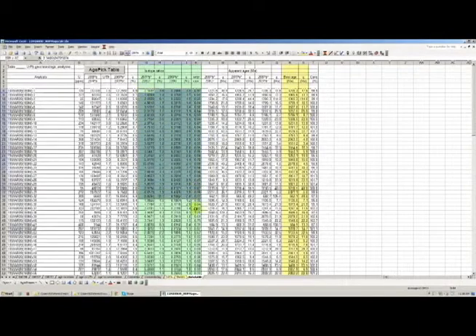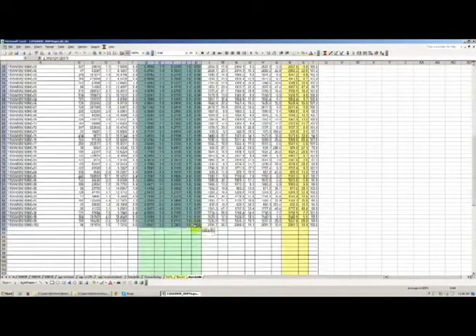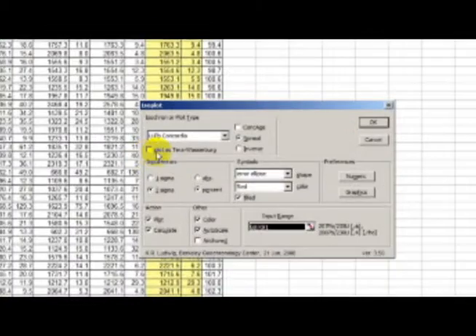So you want to take the columns that you want to plot, just highlight them all. Right. So you go here to the upper ribbon and click on the Isoplot icon again. It opens Isoplot, and in this case, Isoplot already identified that you're going to plot a uranium-lead Concordia. The input errors in this case are 1 sigma, and they are in percent. So we want to plot, and we don't want to calculate because this is a detrital sample, so we're going to have several different age populations, and it's not a single age that we can calculate.